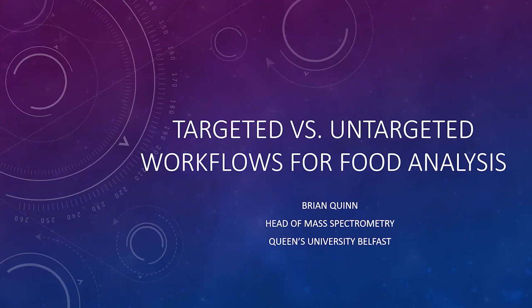Thank you so much for the introduction. Basically, we look at targeted and untargeted workflows for food analysis. There's a big difference between the two, and I'd like to show you what the differences are. In this talk, I'm going to mainly work on untargeted, so it's important that you see the differences.